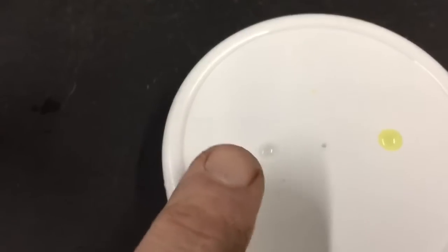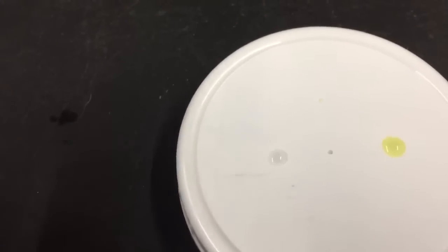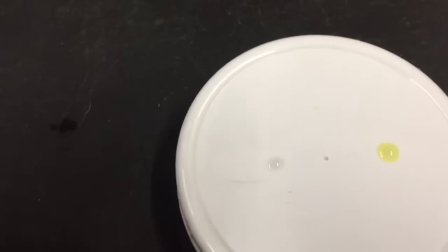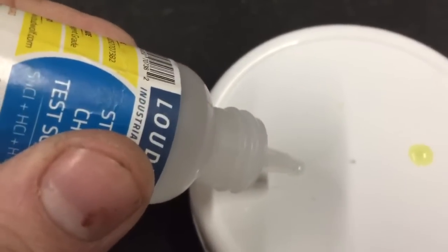You can see the solution known to not contain gold does have a little bit of a black color to it. That's just because there are still some particles in there floating to the bottom. If we add a drop, you can see that there is no reaction whatsoever.